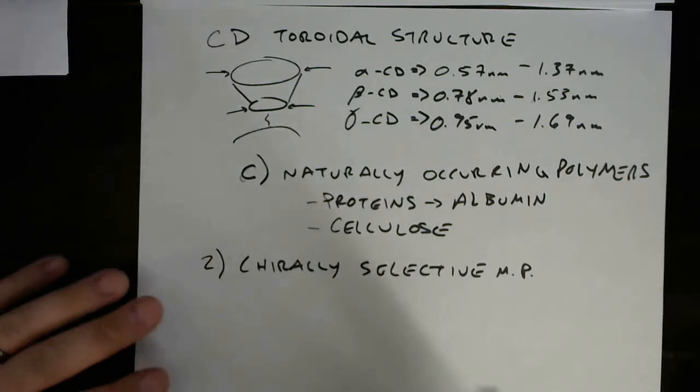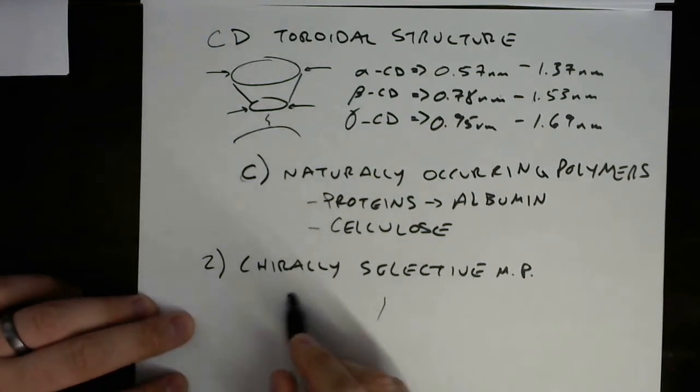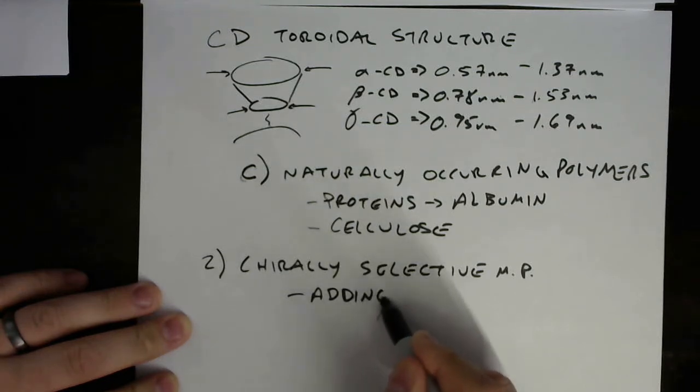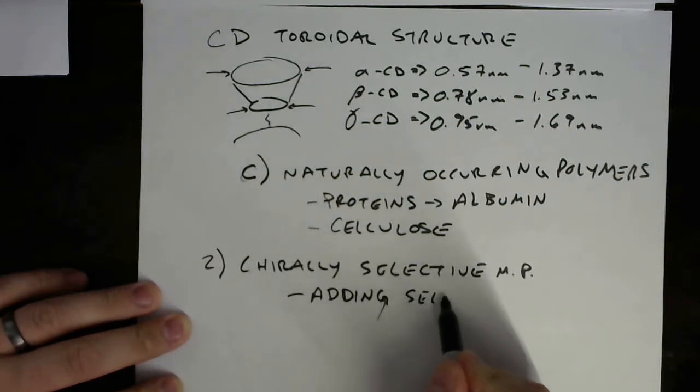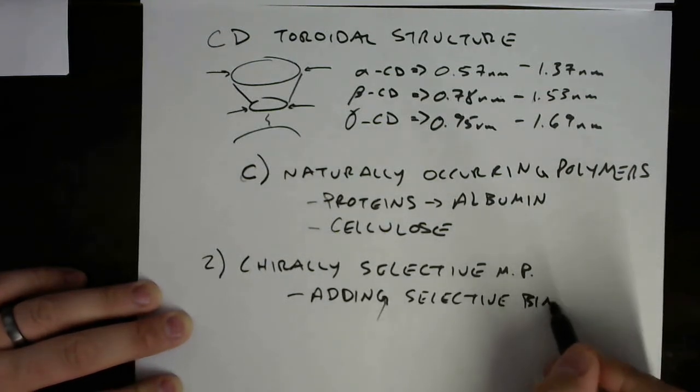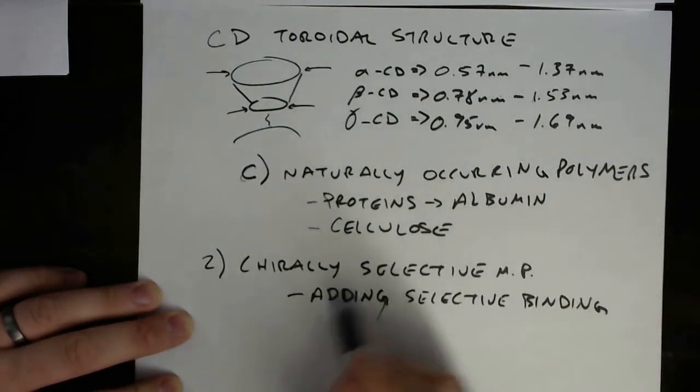And this is done pretty much exclusively one way, and that is by adding selective binding agents or reagents.